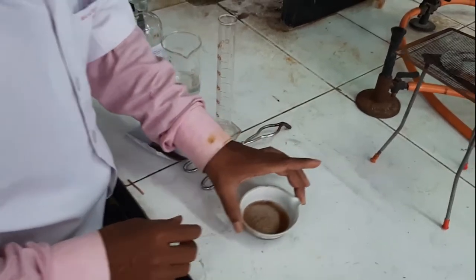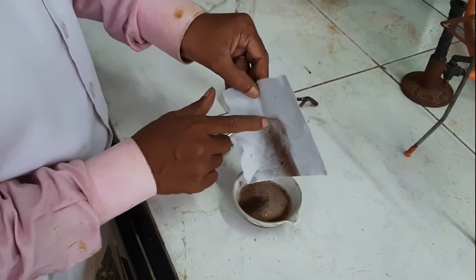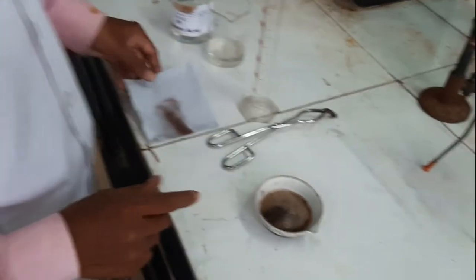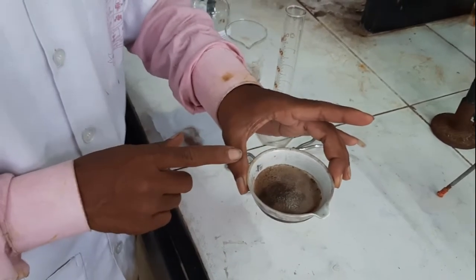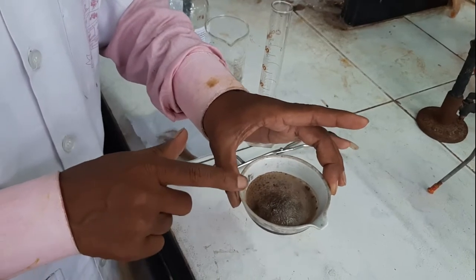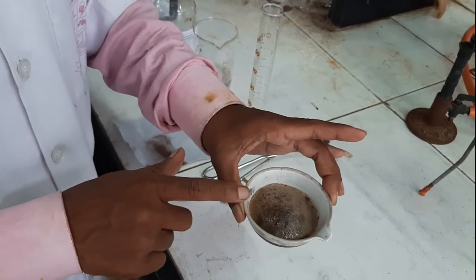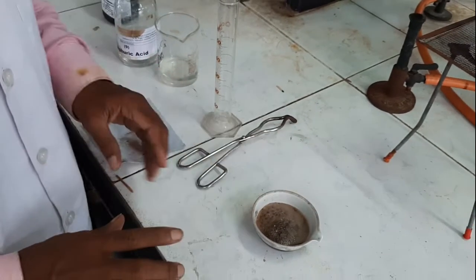After addition of the powder into the dilute sulfuric acid, evolution of hydrogen gas takes place. We have to wait until this evolution of H₂ gas completely ceases, so we have to wait for a few minutes.